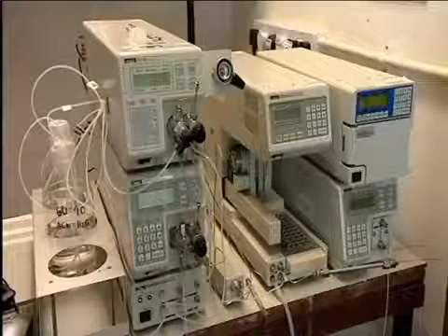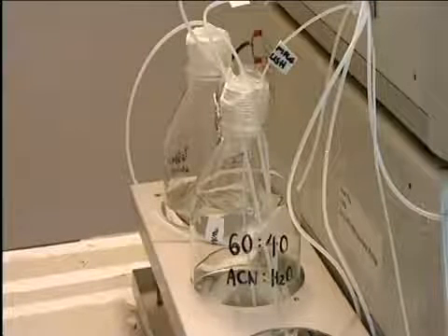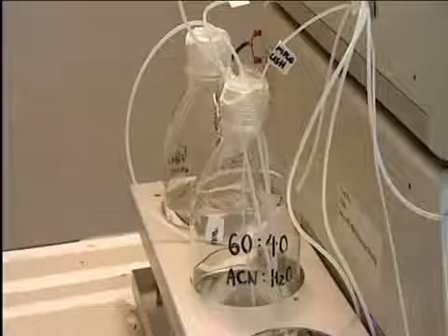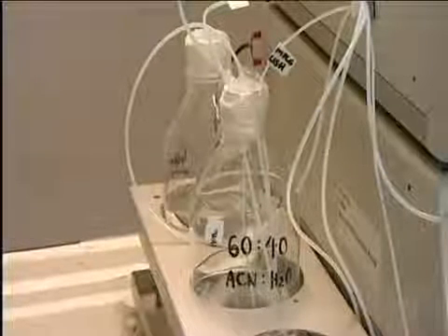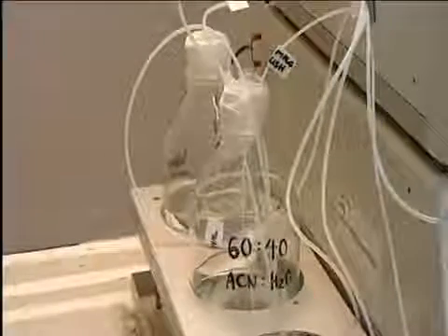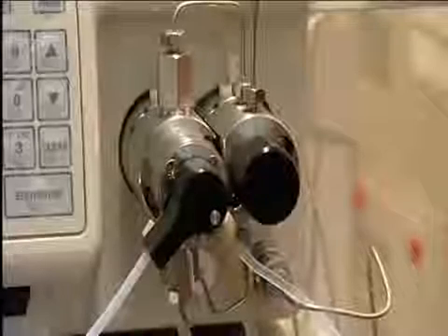The whole apparatus looks like this. These bottles contain solvents. Two solvents can be mixed in any proportions to give a mixture — the liquid phase — of a suitable polarity for the separation that is being done. In this case, one solvent is water, very polar, and the other ethane nitrile, less polar. The operator can decide on a mixture with the correct polarity for the separation she is doing. These are the pumps. They produce a pressure of 15,000 kilopascals, 150 times that of the atmosphere, hence the name, high-pressure liquid chromatography.